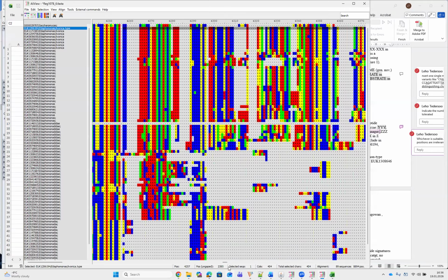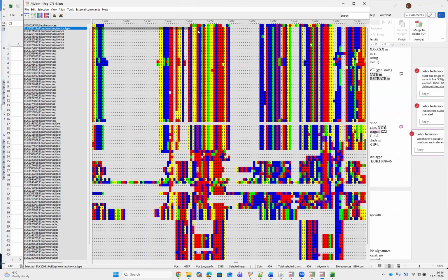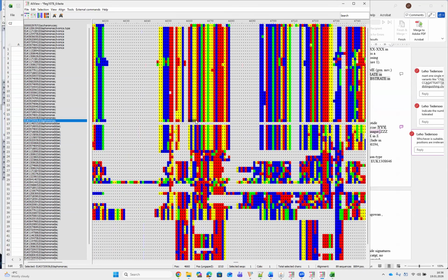So instantly, let's also nominate the key distinguishing nucleotides here. So it's the first A, the fourth G, and the fourth from the end A. So first, fourth, and 17th.